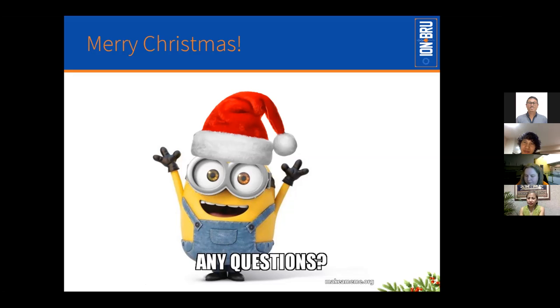I think maybe to answer Mitch's concern, maybe the host sequences can be removed by the bioinformatics pipeline, if I'm not mistaken. Yes, the concern, Paul, is on the distribution of the reads. It's not efficient if you're going to sequence and then 90% of your reads is the host, so to save resources. Okay. So it's like you're filtering out the host reads even before it gets onto the sequencing. Is that correct? Yeah, right.